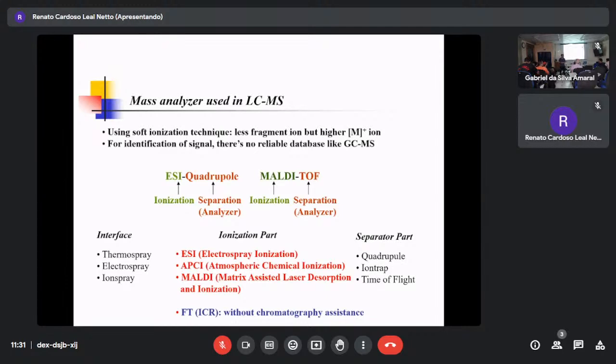But if you use it, you can analyze a small molecule in leaves, for example, and then you can detect a small molecule. MALDI is well suited to ionizing polymers, but it does not mean small molecules cannot be detected, just not fully. That was my point.